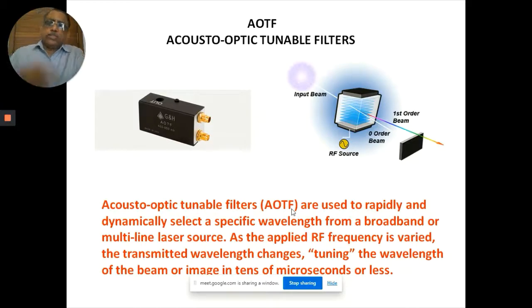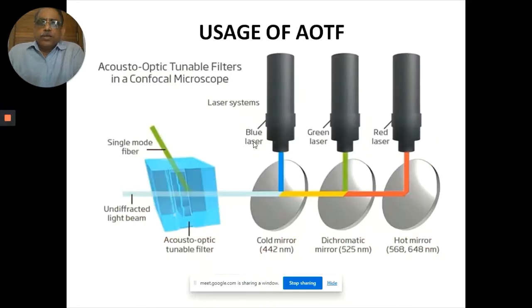This is an interesting class, and you will find this as an application in microscopy, fluorescence microscopy. They extensively use this AOTF filter. It is an acousto-optic tunable filter, right? You can see how exactly they can use it for three lasers, simultaneously tuning and selecting them. If you want to do a three-line excitation for your fluorescence imaging, you can selectively filter using an AOTF. One AOTF can do the three purposes simultaneously. That was something interesting to look at. This is a special filter.